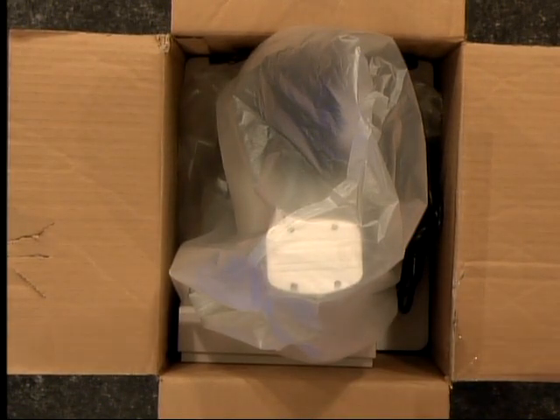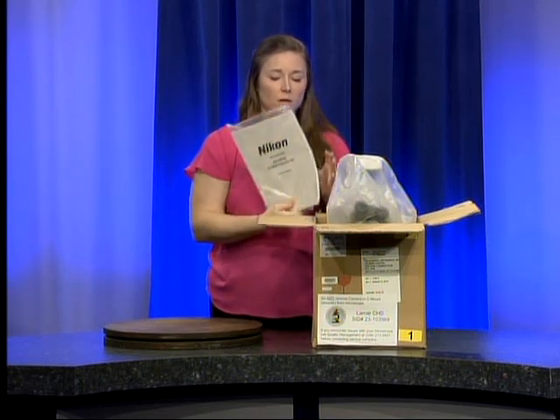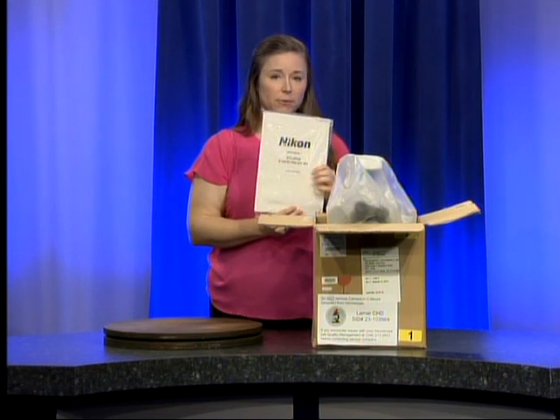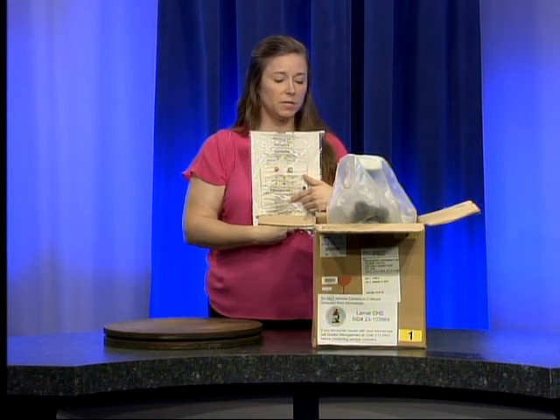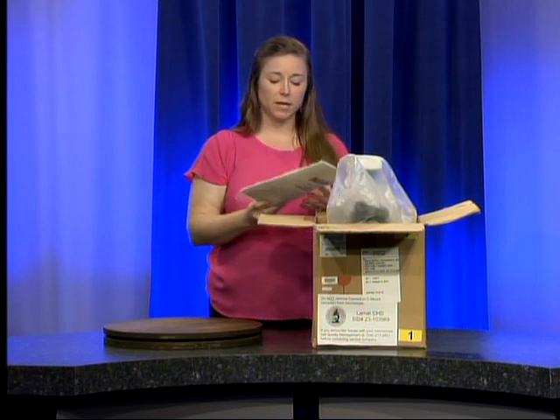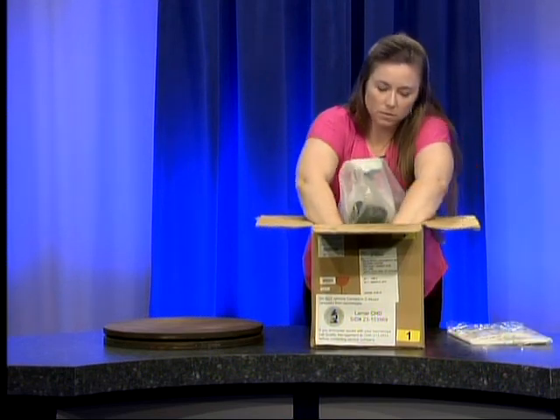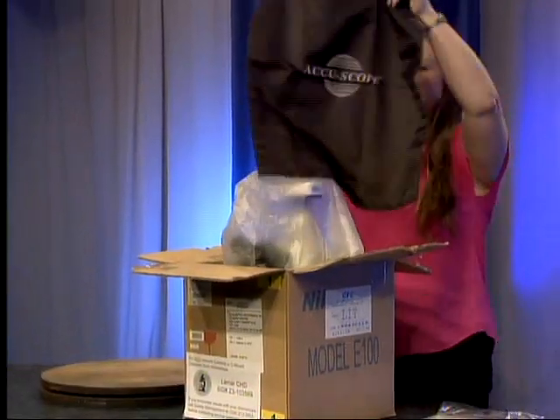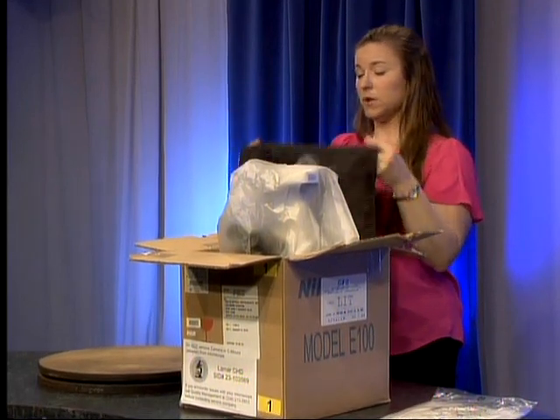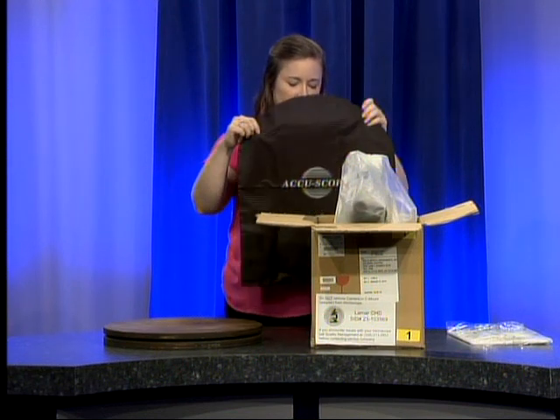The first thing I pulled out here is the manual, and in the bag with the manual is a plastic bag. It would really be a good idea for you to read the manual to make sure that you fully know how to use the microscope. This plastic bag is going to be a dust cover for your microscope, but plastic eventually is going to break down. So we also wrote into the grant a nylon dust cover that will last a whole lot longer than the plastic one. This says AccuScope on the front, but it's just the cover that fit this Nikon microscope the best.